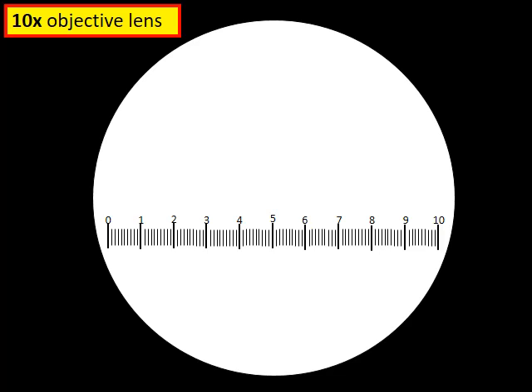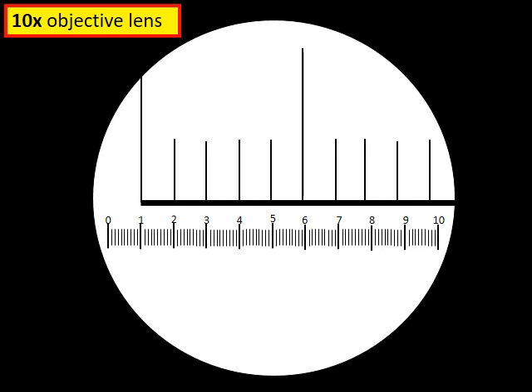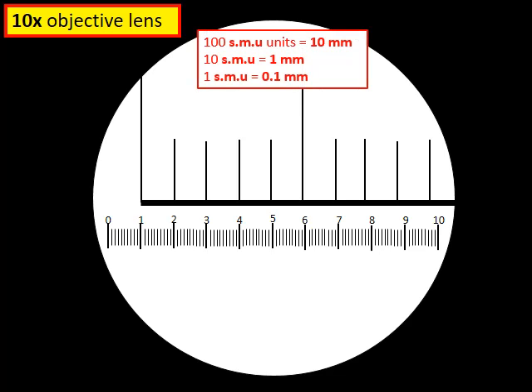Every time we change the objective lens, we have to recalibrate the microscope. We've now moved from the four times to the ten times objective lens. The eyepiece graticule scale in the eyepiece looks exactly the same, but when we place the stage micrometer under the ten times objective lens, we expect it to appear two and a half times bigger, because the ten times objective lens has two and a half times more magnification.